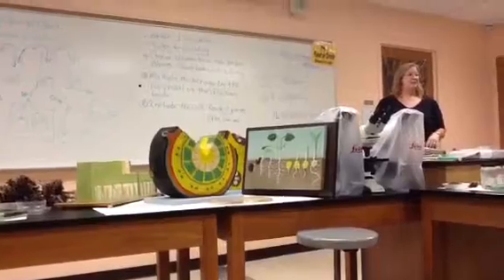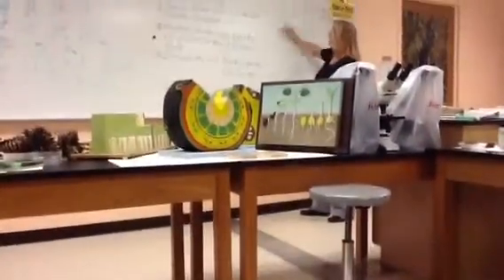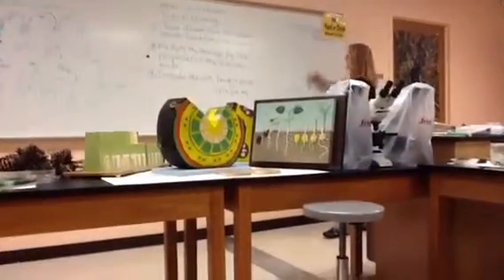Does that make sense? All right, let's do another one together really quick. Let's say that you decided to count the minus 8 dilution.